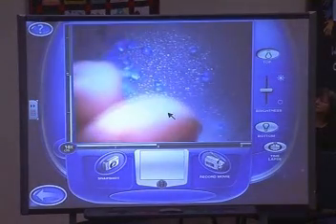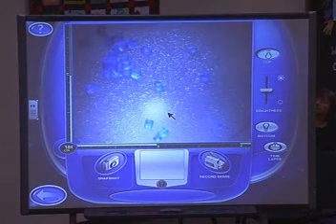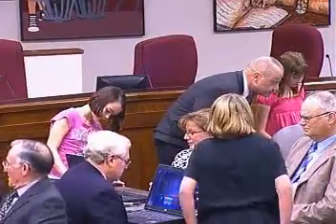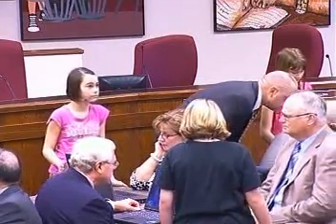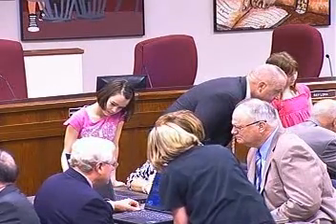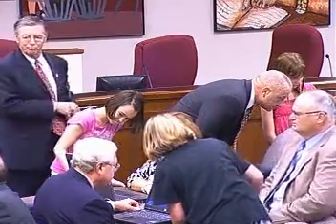But we can take a look real close at sugar, and we can talk about the shapes of them. And just as the board members are doing up here, groups of kids can stand around and look at these things and talk about why they see what they see. You may have seen sugar up this close before, you may not have, but the kids can talk about what it looks like and why it looks that way. We can even zoom in further to 60 times magnification. This is magnified 10 times, but they can zoom in even further and we can study it close up. And we do this with lots of different things. We've got a good sugar cube over there.